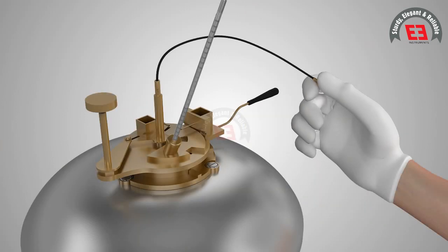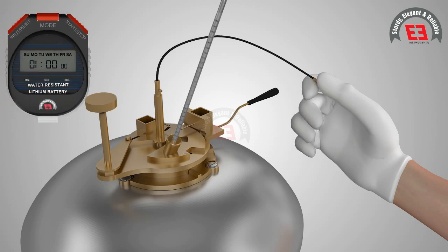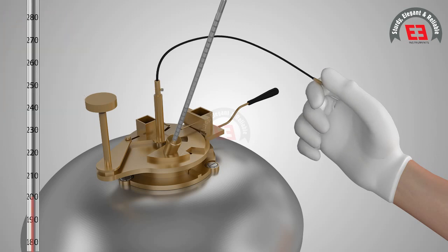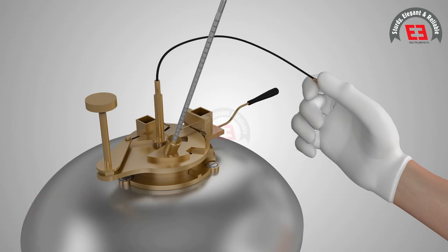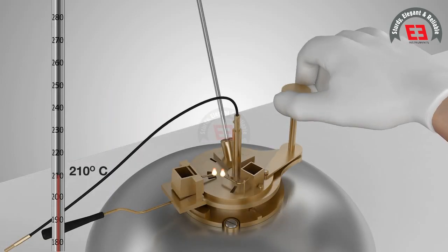The stirring is done at a rate of approximately 60 revolutions per minute. When the specimen attains a temperature of about 17 degrees Celsius below the expected flash point, the stirring is discontinued and the test flame is applied on the sample.